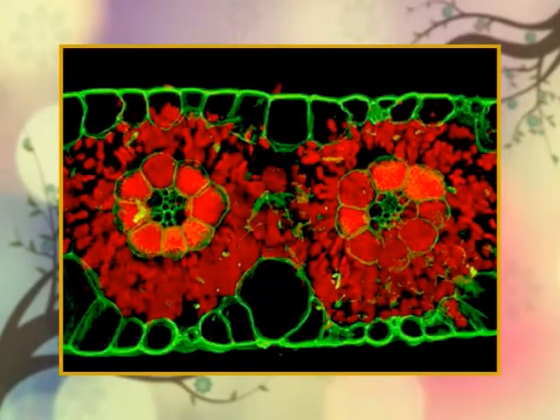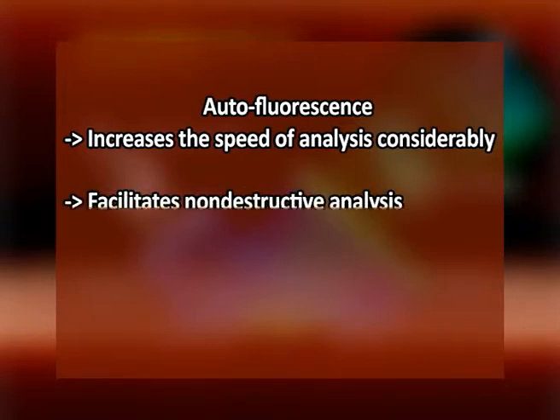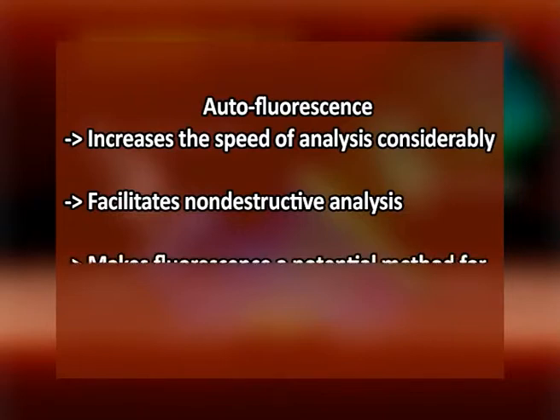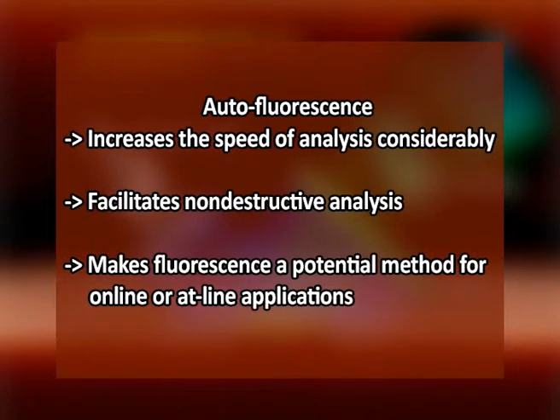However, for food analysis, the intrinsic fluorescence of the intact food, called autofluorescence, can be measured. The use of autofluorescence increases the speed of analysis considerably, facilitates non-destructive analysis, and makes fluorescence a potential method for online or at-line applications.